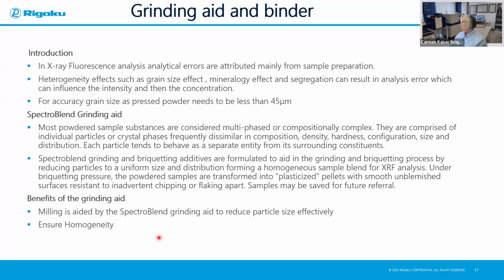The problem is most powdered substances are multi-phased or compositionally complex, and they comprise individual particles and crystal phases with different hardnesses, different densities, different configurations. So each particle that is present behaves as a separate entity. And so this spectra blend helps to reduce this and form a homogeneous blend for XRF analysis.